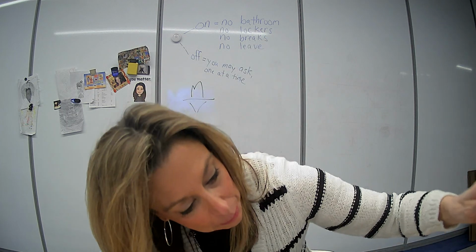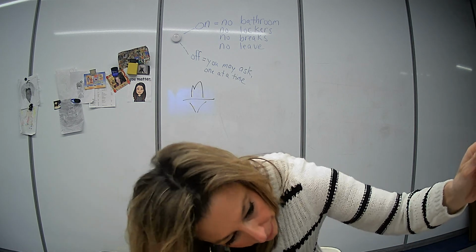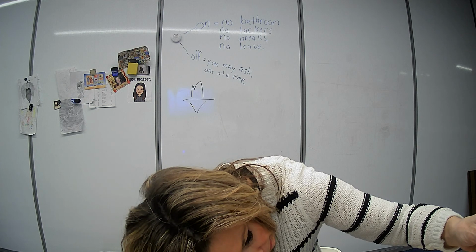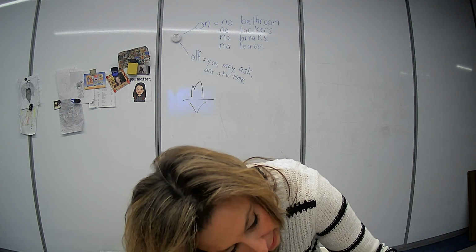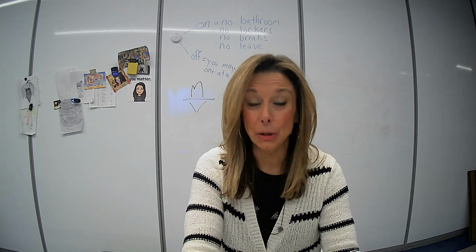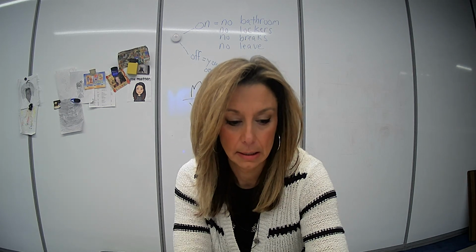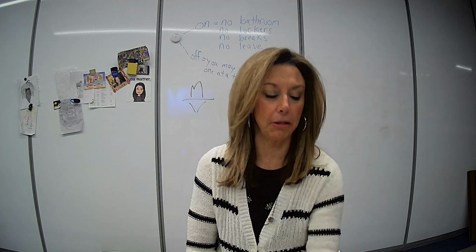So I'm going to press it down just a tad, and this time we have gone up to 36 milliliters. So what is 36 minus 25? It is 11. All right, so 11 milliliters is the volume of our third one.